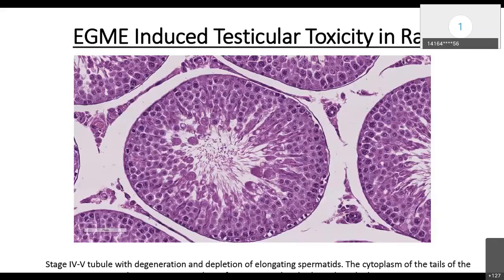So I would strongly recommend that anybody of you, if you are going to join a CRO in future, or you are already associated with them in some way, then make sure that peer review of histopathology slides is always done. It's very, very important. Next one.